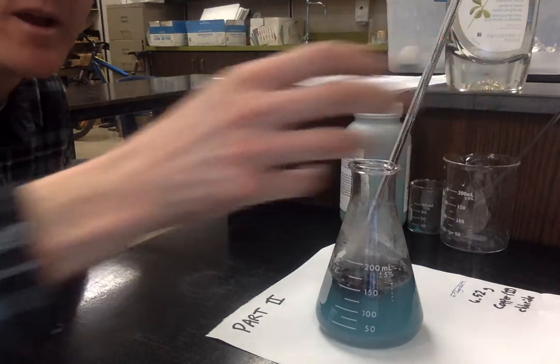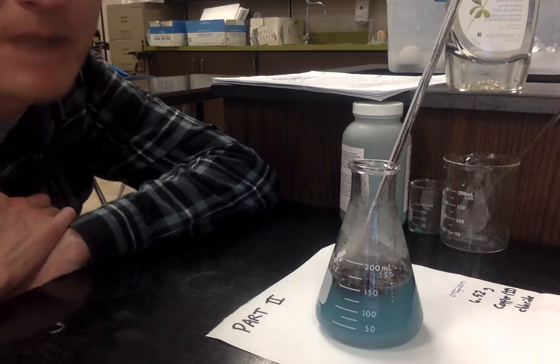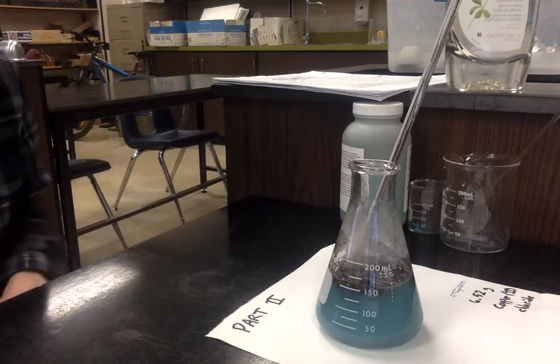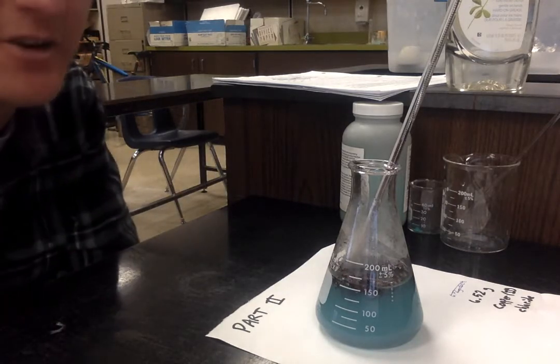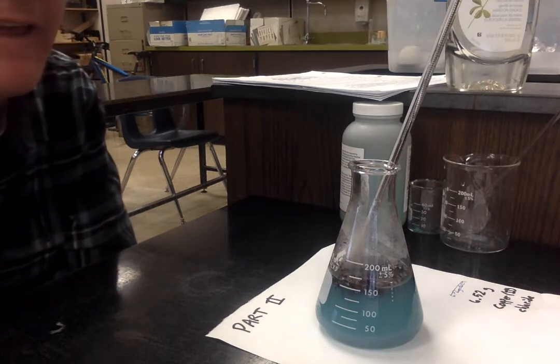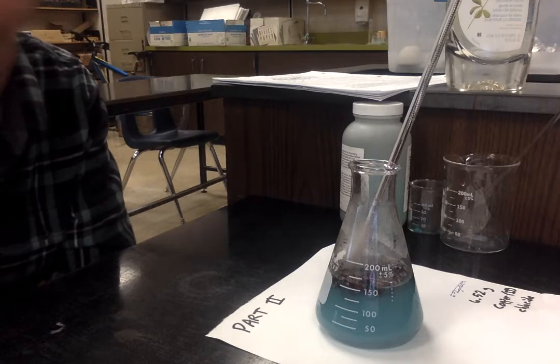You can't hear it, but I can hear crackling and popping as the bubbles come to the surface. This is a more complicated reaction because it involves hydrogen being made, but again, Chemistry 11, the single replacement reaction is something you should be able to get from this.